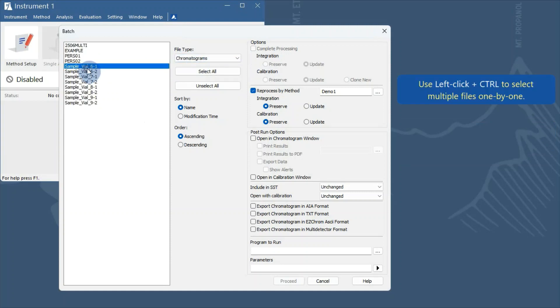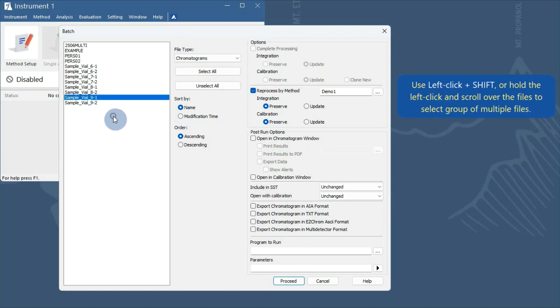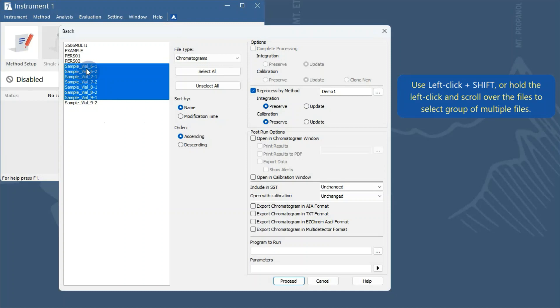Use left-click plus Control to select multiple files one by one. Use left-click plus Shift, or hold the left-click and scroll over the files to select a group of multiple files.